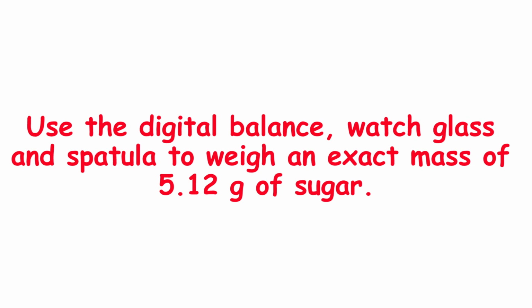Right now, use the digital balance, watch glass, and spatula to weigh an exact mass of 5.12 grams of sugar. Pause the video to write the procedure, then play it back when you're ready.